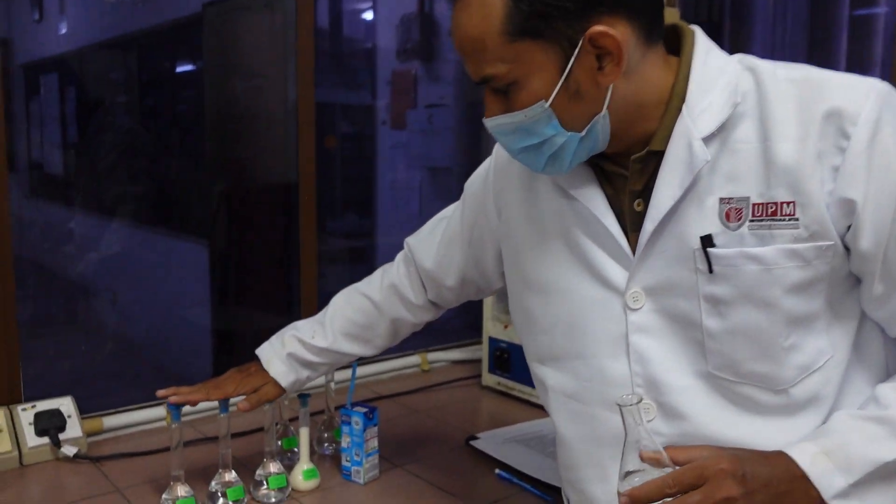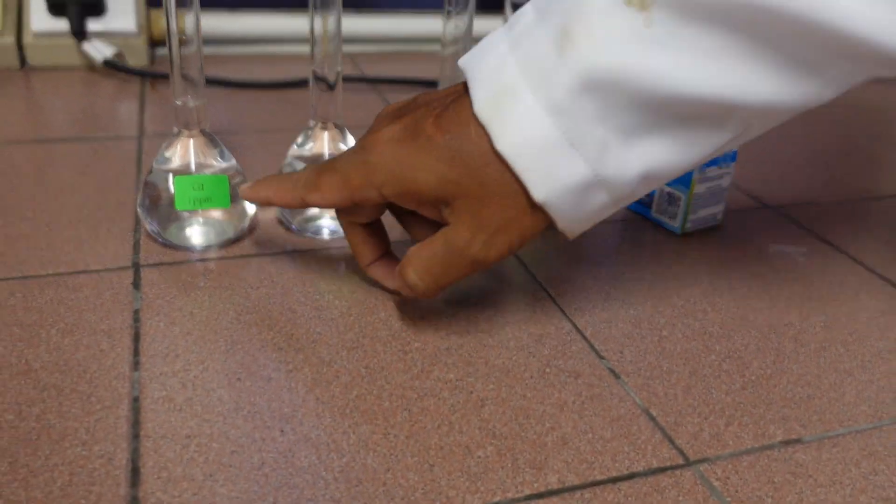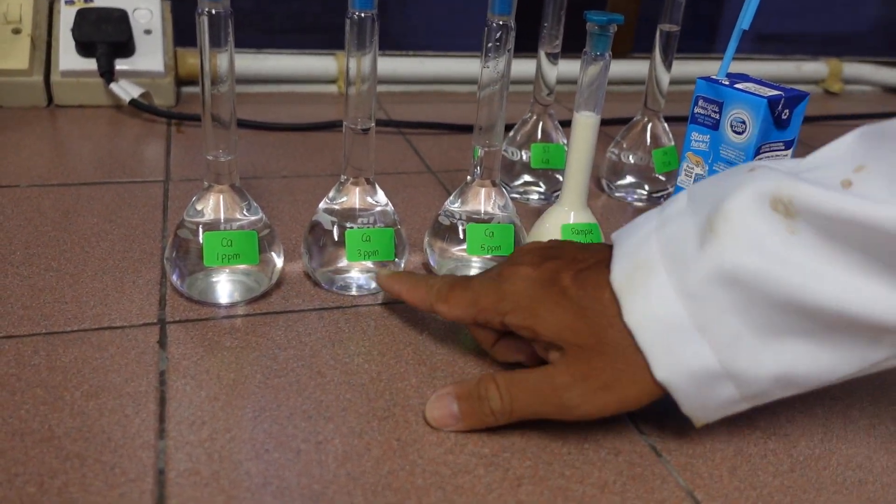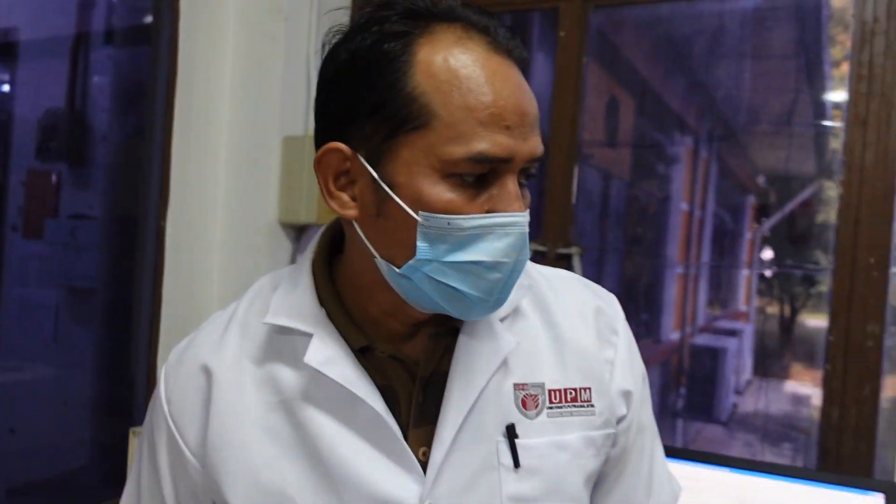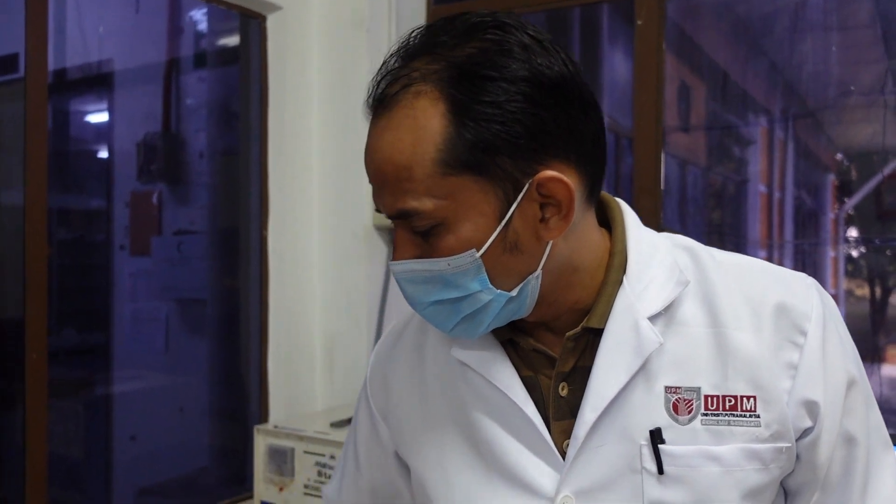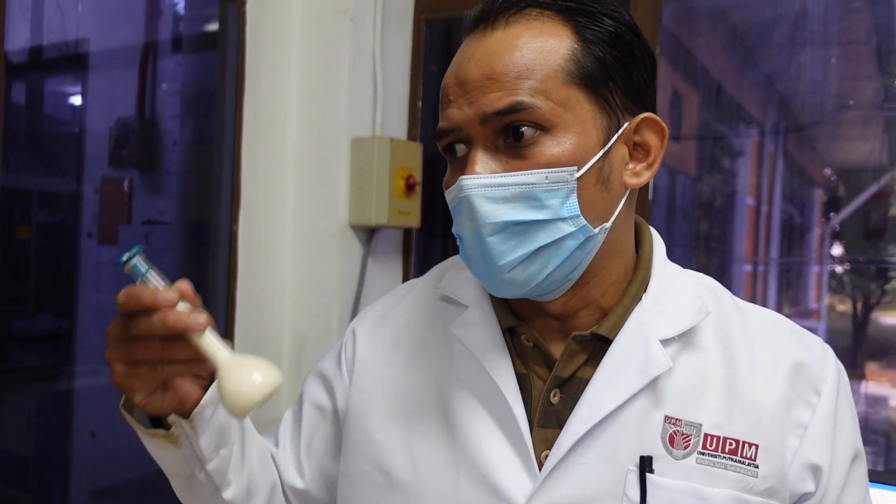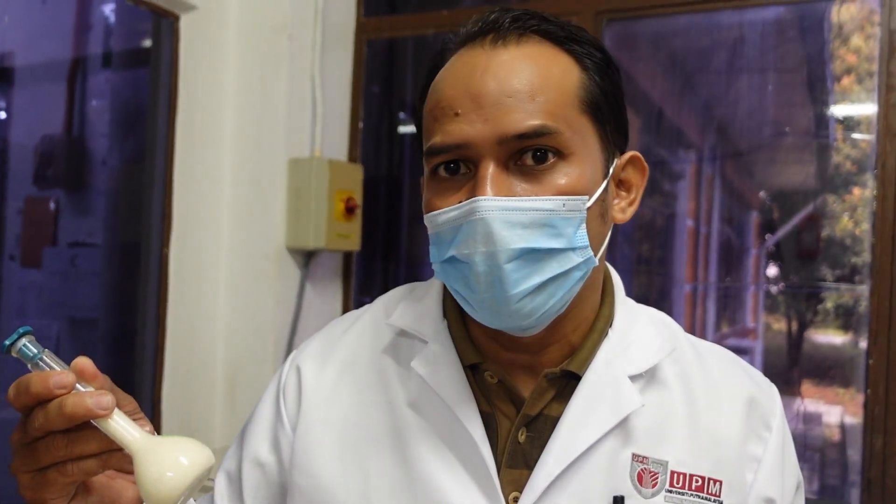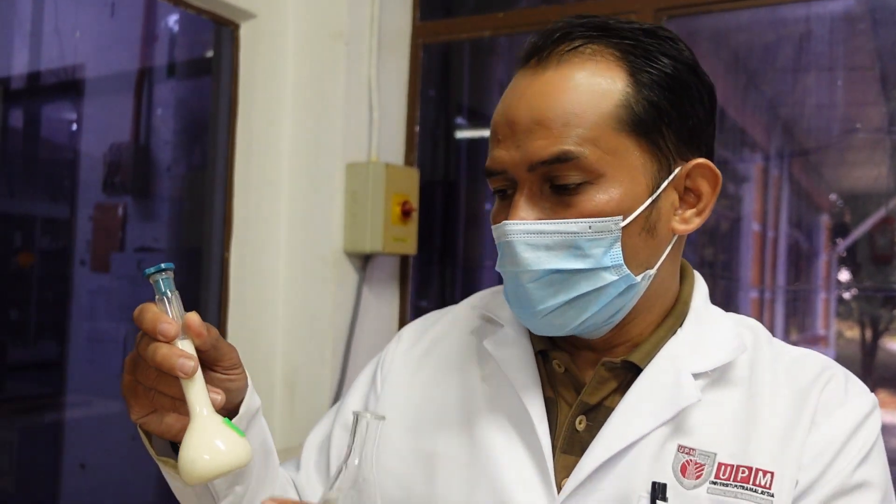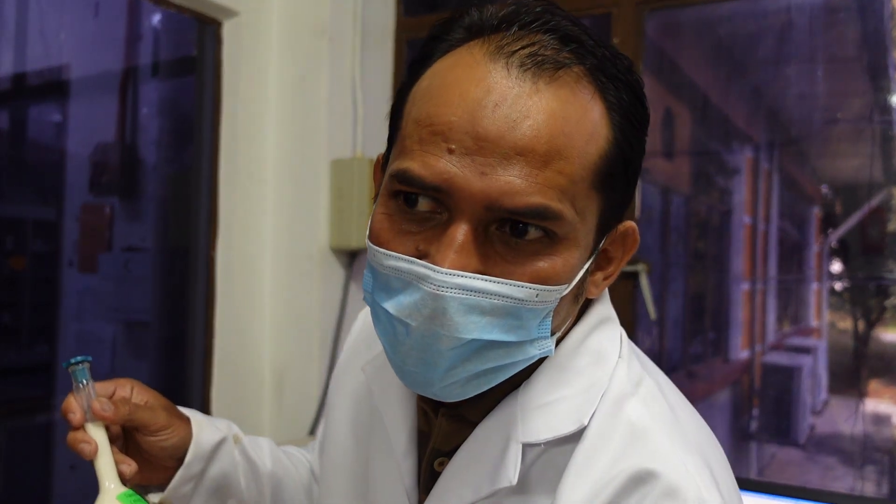Then you start with your standard. We already prepared three different concentration standards. You start with the lower concentration first: 1 ppm, then 3 ppm, 5 ppm. Once you're done with the standard, then you can run your sample. You can run as is or you have to dilute, depends on the standard. If the concentration is too high, exceeds the standard level, you have to dilute it. One beauty about AAS, it's pretty straightforward. You don't need to do extraction and those tedious preparation methods.